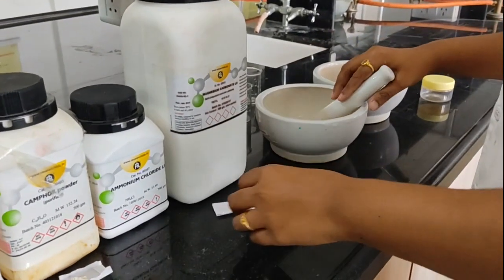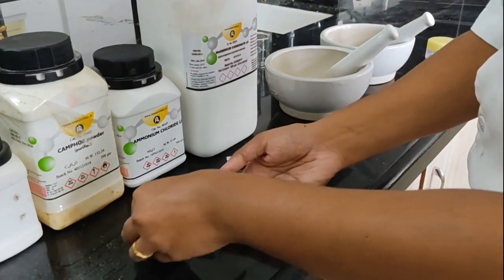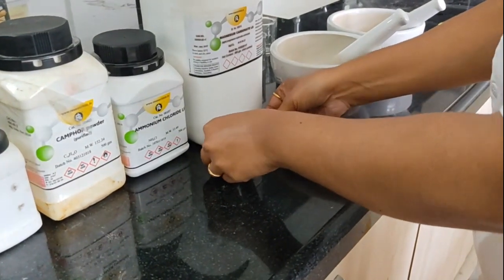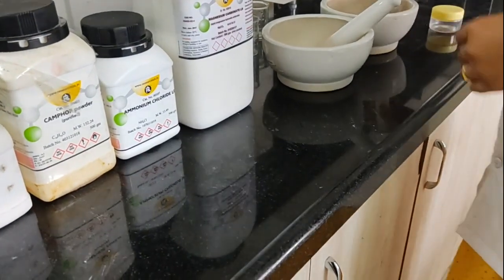And in the second mortar I am going to add this camphor and this magnesium carbonate, and again going to triturate it properly.